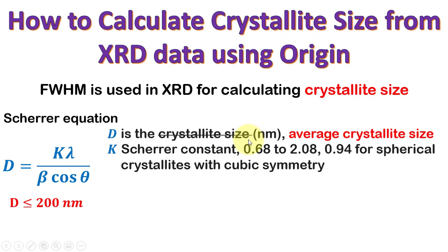The value of Scherrer constant changes the crystallite size from approximately 70% to 200%. The value must be exactly known, otherwise the crystallite size will not be authentic.